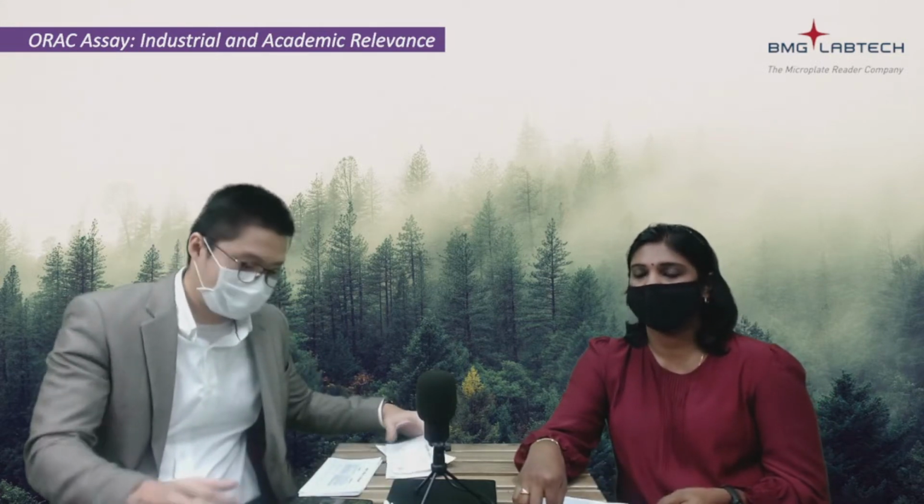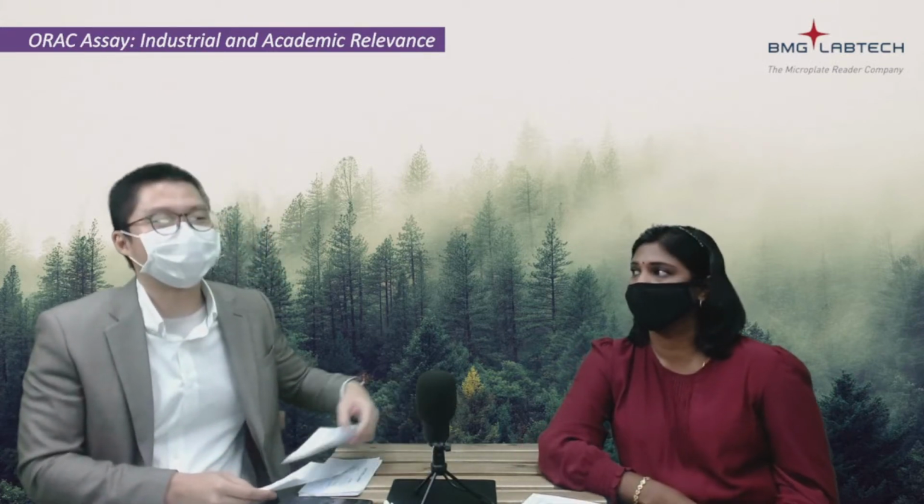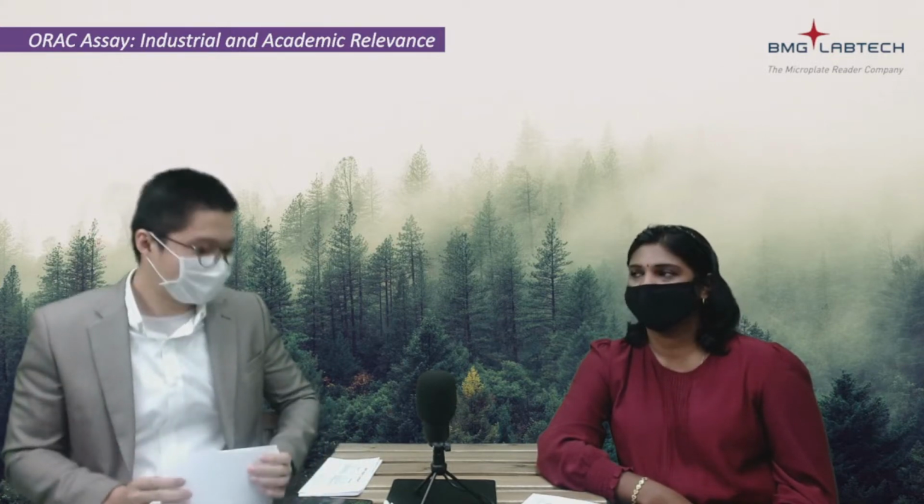So the first question that I'll ask is that we know that there are many different types of ORAC assays, sorry, not ORAC assays, but antioxidant assays. So how does ORAC differ? Why do people do ORAC? What's so special about ORAC?